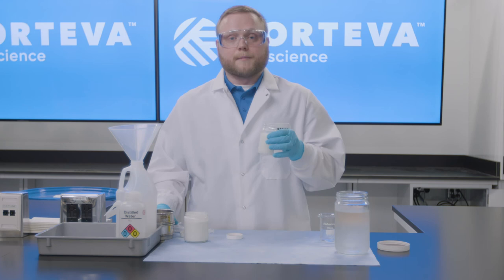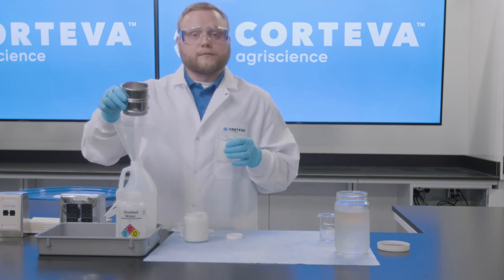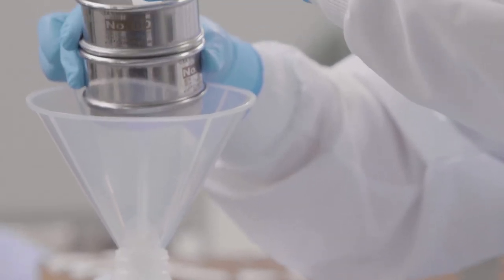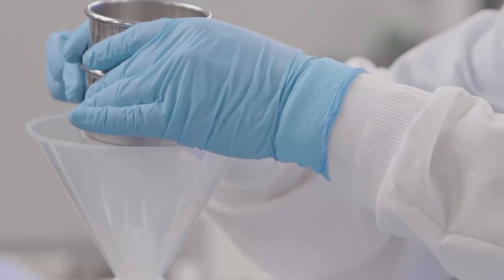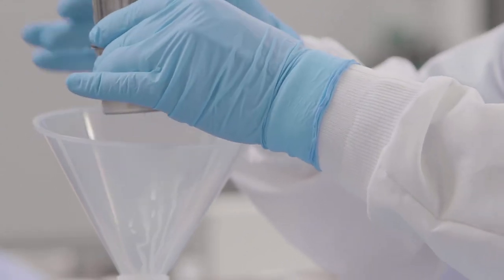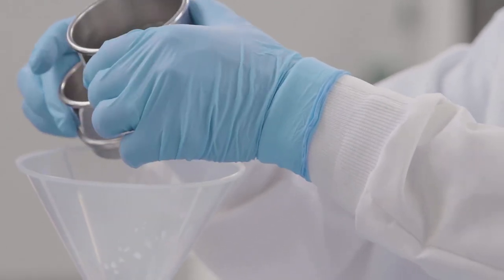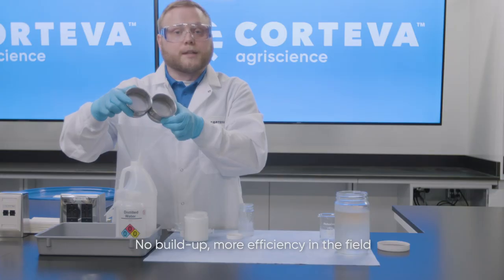As we pour this sample, we're going to want to look for any flocculation, any solids caught on the sieves, or any crystallization. As we can see, the material is running through the sieves quite nicely — and very quickly it's all the way through both sieves. Taking a look at both the 50 mesh and the 100 mesh sieves, we can see that they're completely clean.